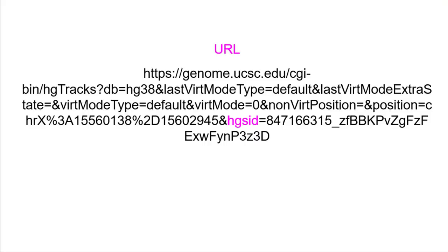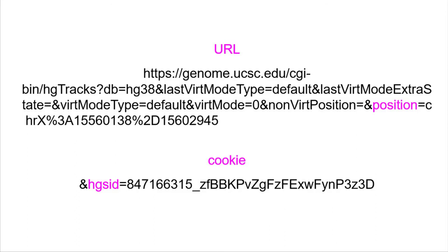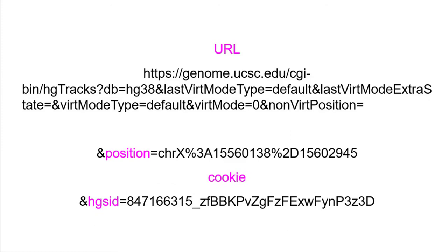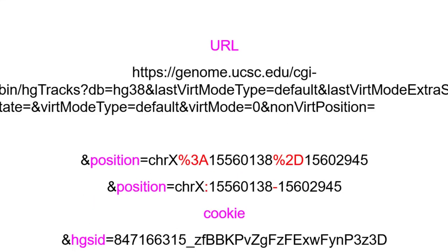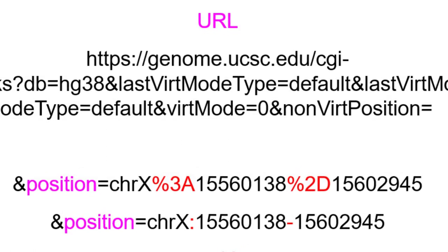Let's dissect the URL we saved and use that information to build the URL that will do what we want. We'll pull it apart into its key-value pairs. Each is separated from the others by an ampersand. Starting from the end, we'll dissect it in pieces. The session ID we'll want to throw away as we just discussed. The position parameter is next: ampersand position equals chromosome %3A coordinates %2D coordinates. This is simply an encoded form of chrom colon chromStart hyphen chromEnd.